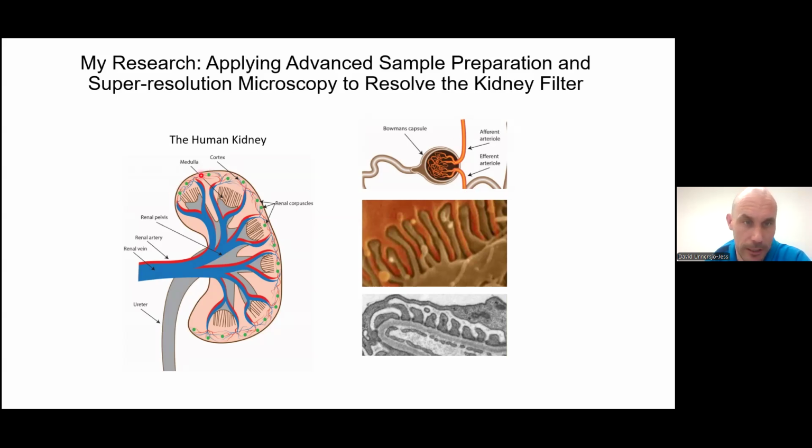These are schematically drawn in green here in the cortex of the kidney. It's a tuft of very tiny capillaries. The unfiltered blood enters, the filtered blood exits here, and in here is where the filtration takes place. These capillaries are just a few micrometers in diameter, so the red blood cells cover the whole diameter of the capillaries. They are really lined up in these capillaries.